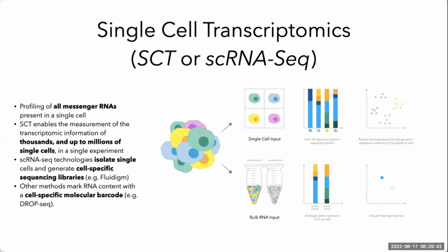The approach of attaching a barcode, or identifier code, to each and every sample in our library will help us count or quantify the expression pattern very efficiently and without subjecting it to biases that we will discuss in upcoming slides.